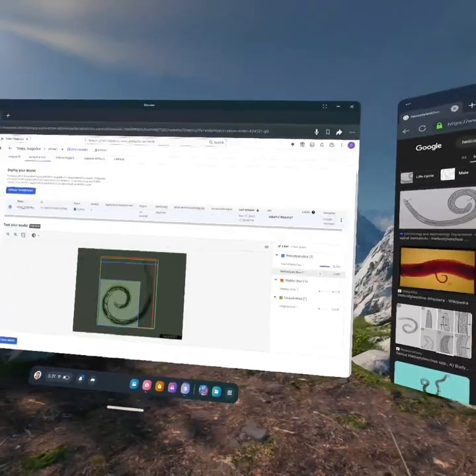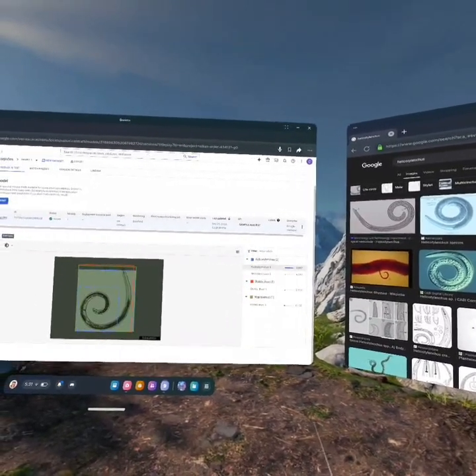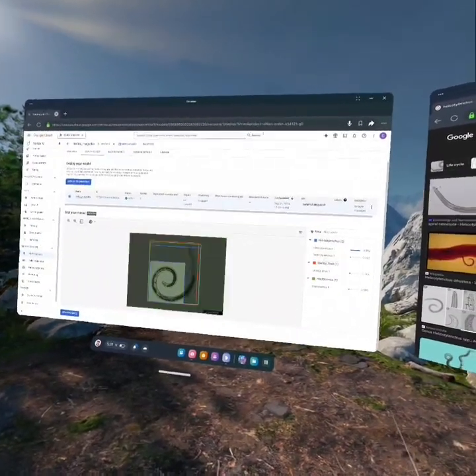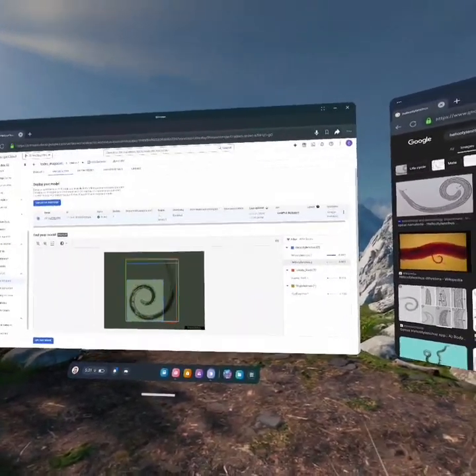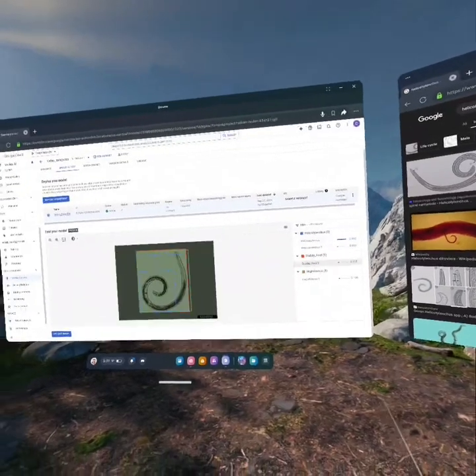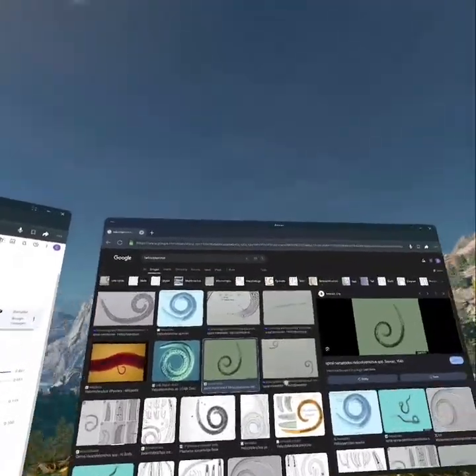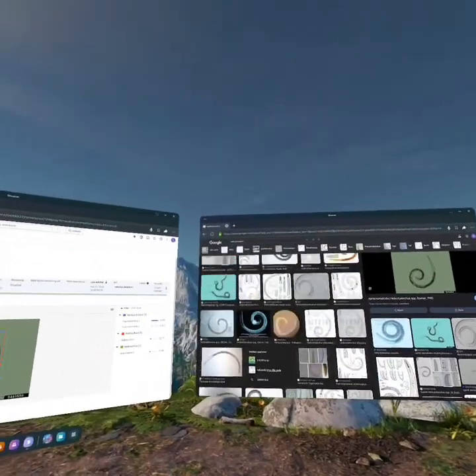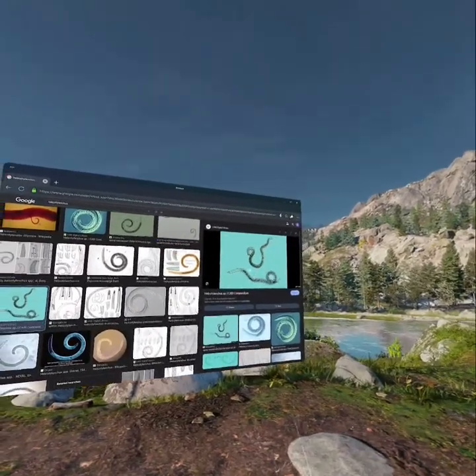89% for one, and then, yeah, I've noticed a lot on some of them, they will create these other bounding boxes like that one there. And I know why it does. And if you watch the YouTube video that I'm going to make that has more information, I can explain why. But it comes back to just being able to add more photos. Let's do this other one here.